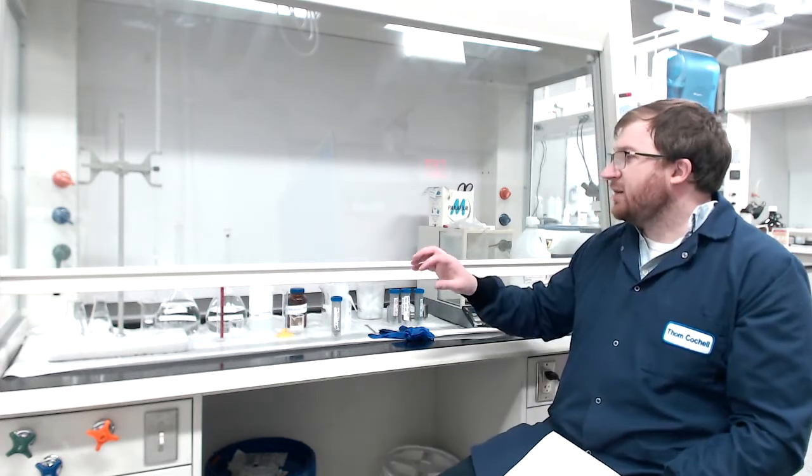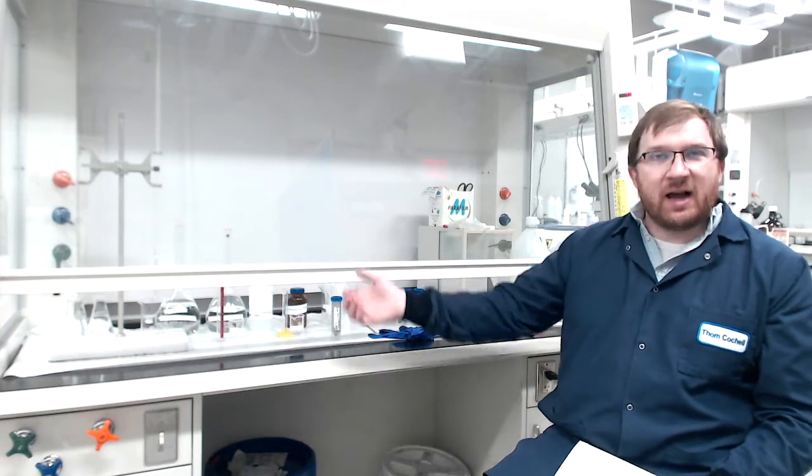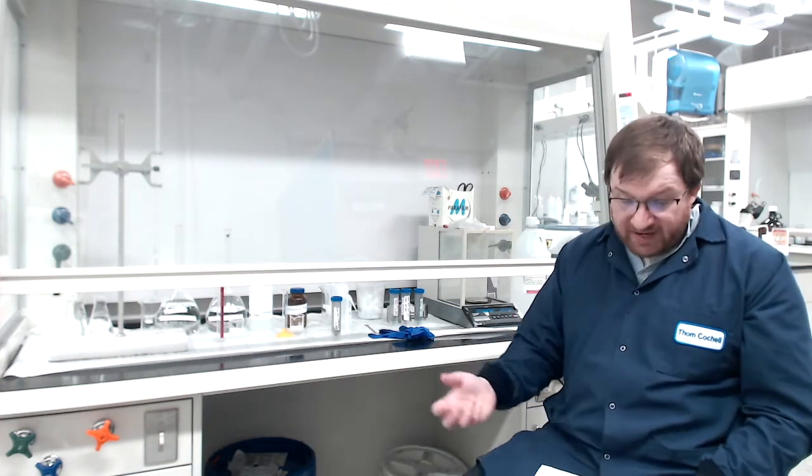We're going to run one as an example, and then there's a bunch of data up on the share drive for you to analyze and calculate oxygen contents for our samples. We are going to run three sets of each, so there'll be lots of data for each group and their different powders to find out oxygen content.